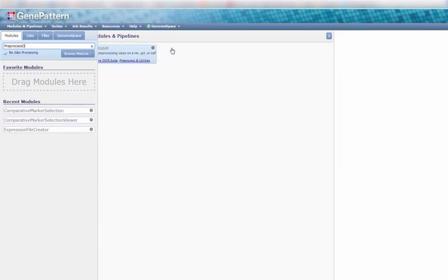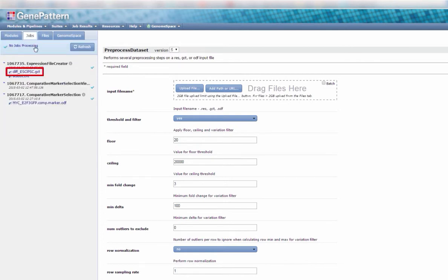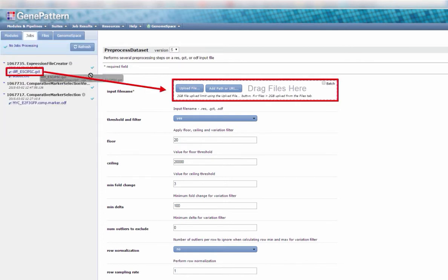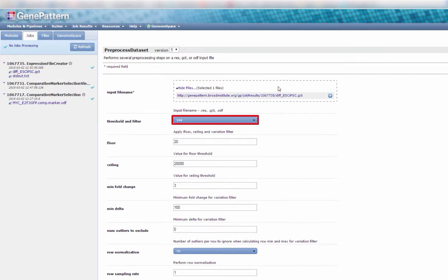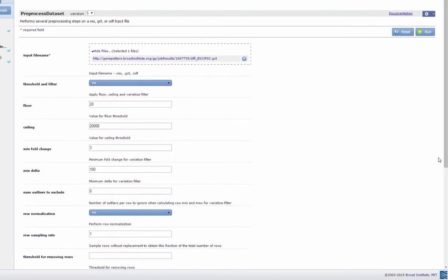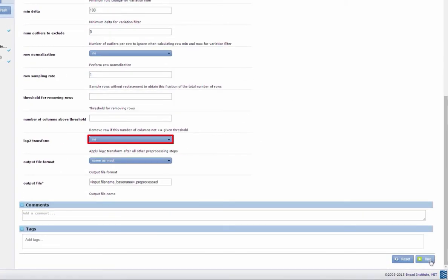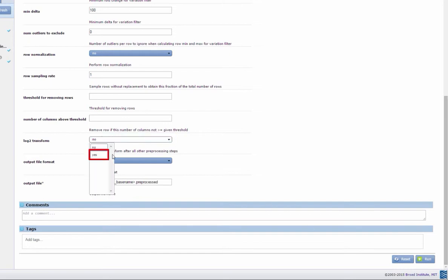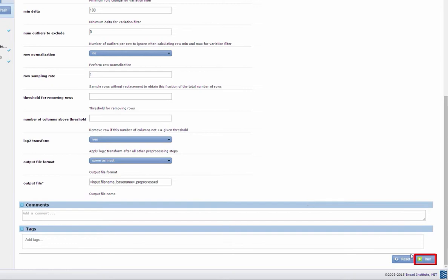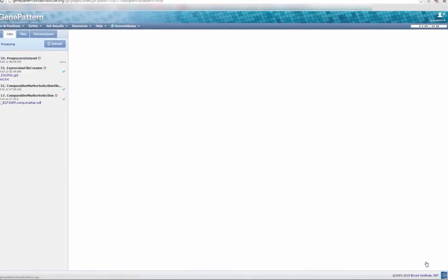Under the Jobs tab, click and drag the output from your previous job, diff-esc-ipsc.gct, to the Input File Name field. Set the Threshold and Filter parameter to No and the Log2Transform parameter to Yes. Click Run and wait for your job to finish.